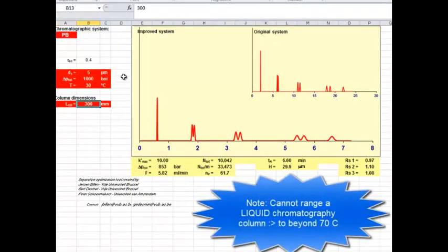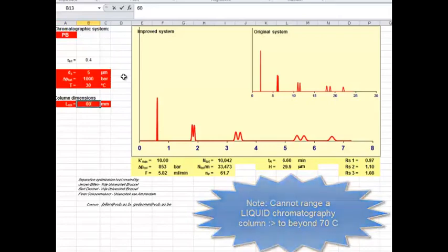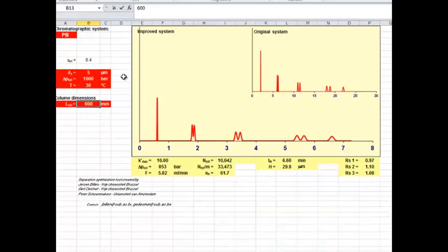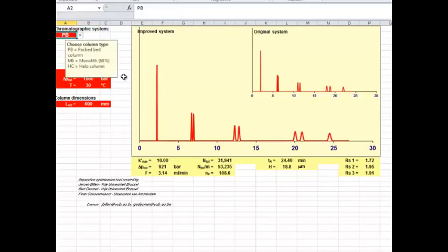And then finally, the length of the column. Let's go to 600. I know that's going to linearly increase my pressure, and it didn't do a lot to my plate height. So in any case, it gives you a sense of how you can play with all of these variables.